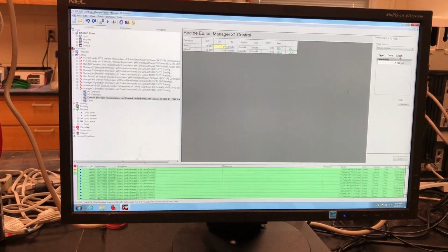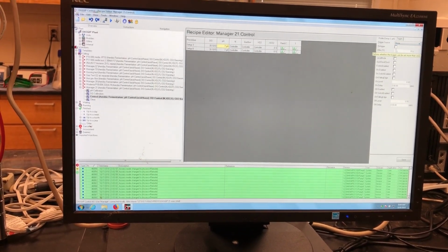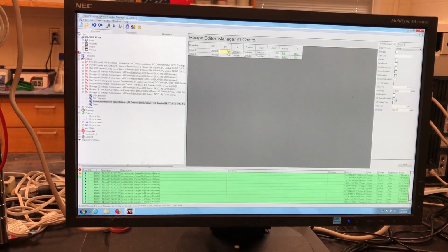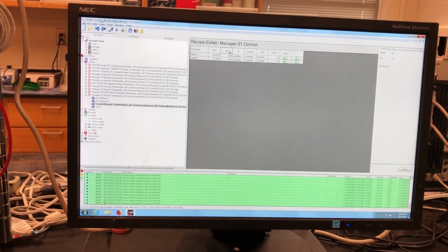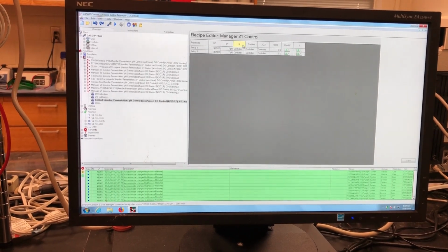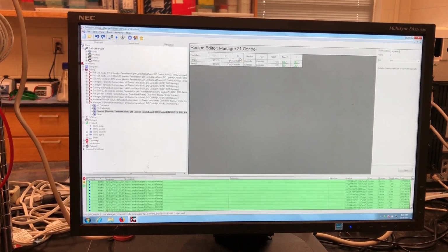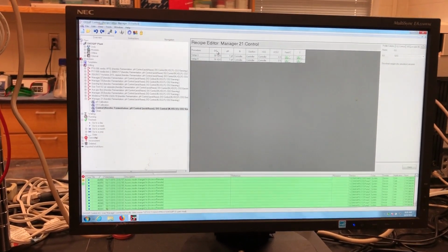You can enter your data for what set point you want. You can look at the graph. You can also use different triggers so that you can have the pH control start with different parameters setting for its start, and also turn off with different parameters set for its switching off. And likewise, you can have it change how it interacts with the acid and base pumps. You can adjust the agitation, gas flow, oxygen percentage, all those things independently, but in most cases we leave those controlled by the cascade linked to the DO, so you would just adjust them with the DO controller there.